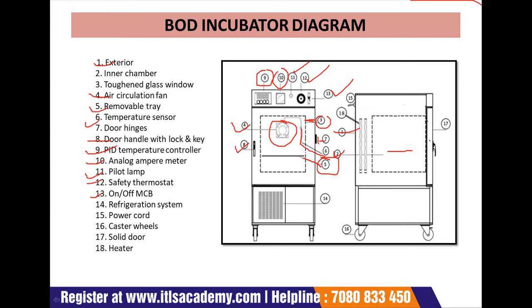Please see this diagram, students, very clearly and very sincerely, because this is the basic diagram of the BOD. You should know about the basic diagram of the BOD. So now we will discuss the 14th. This is 14, the refrigeration system. This is called the refrigeration system. And 15 is the power cord.